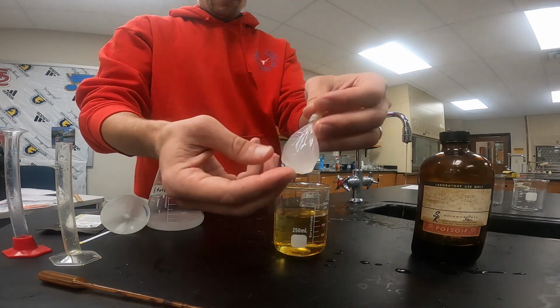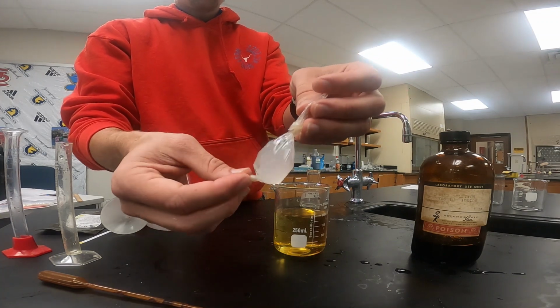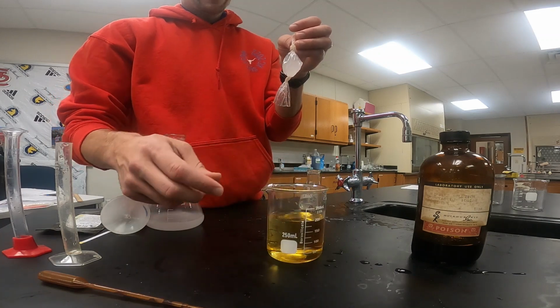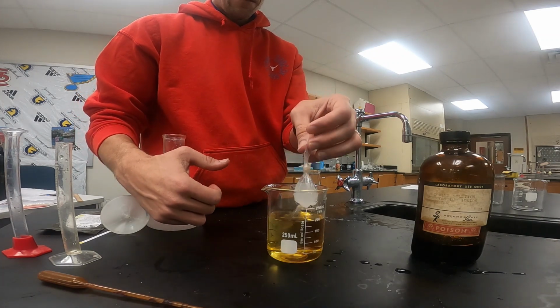So we've gotten our dialysis balloon created. We've tied off both ends. Inside the balloon we have our starch and sucrose solution mixed together, and we're dropping it into our beaker with iodine and water. We'll allow it to sit in there for approximately 20 minutes, and then we'll come back in 20 minutes and see what it looks like.